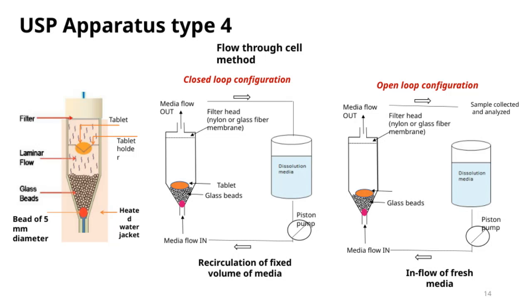Now, let's take a closer look at some of the key components involved in the USP apparatus Type 4.